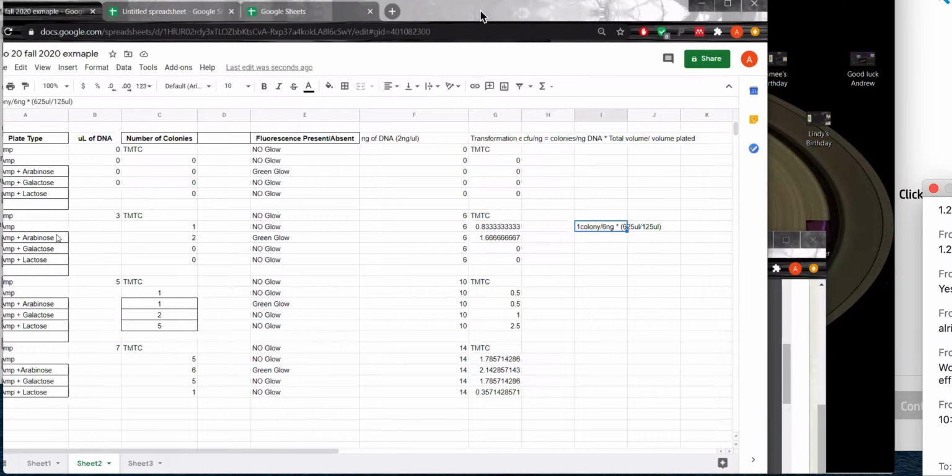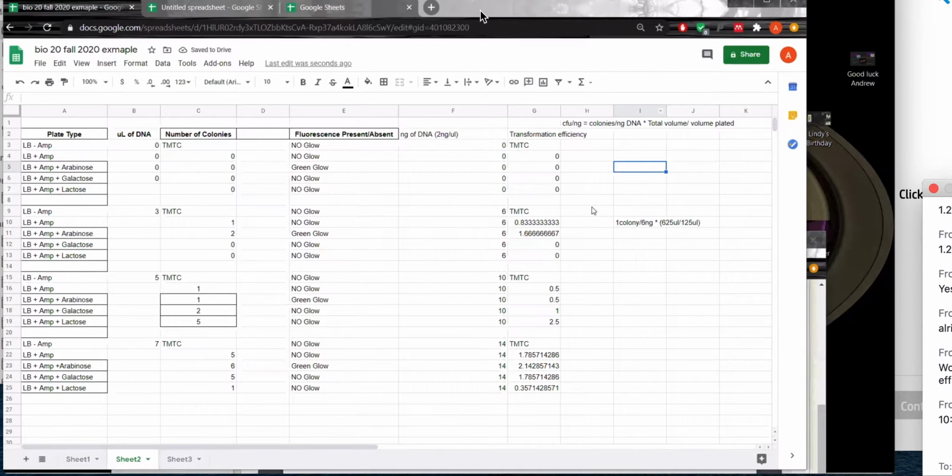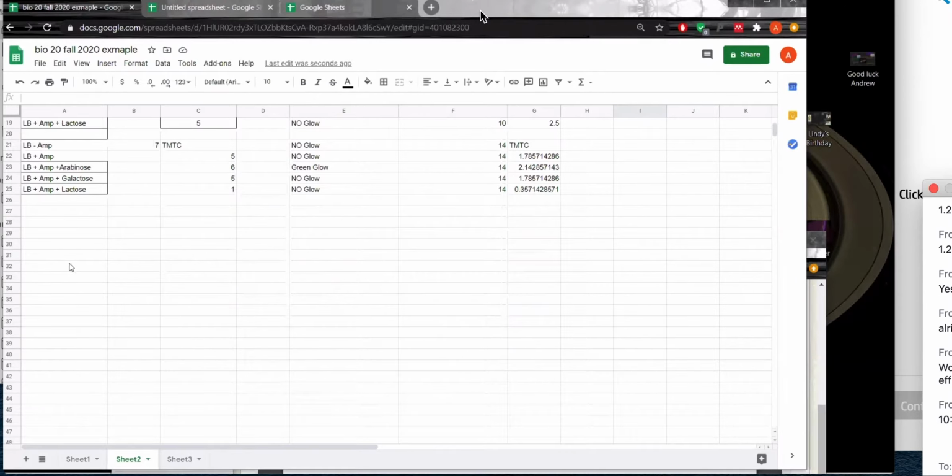Alright, nice. So I was just asking Dr. Burnett whether we should do a scatter plot for each type of plate or just do the average. And we're just going to do the average. You might do it as a separate table so it'll be easy to graph. Ah, that's true. So all these numbers, you just do it as a new table.